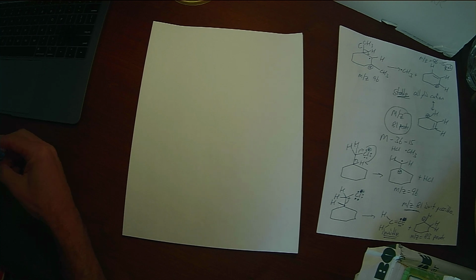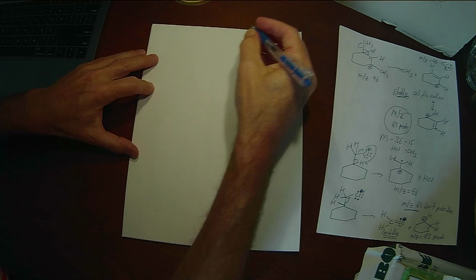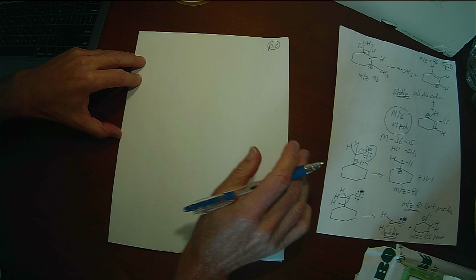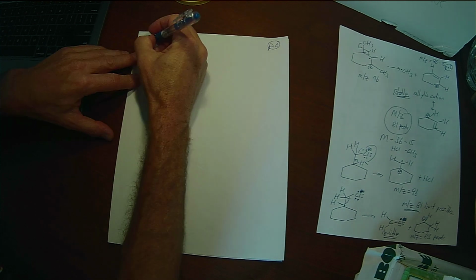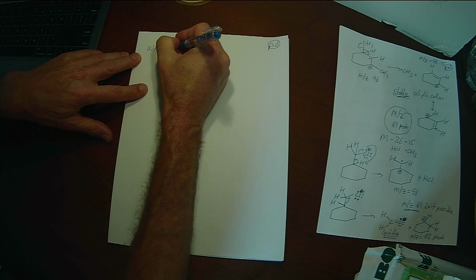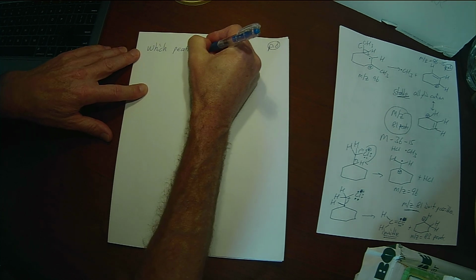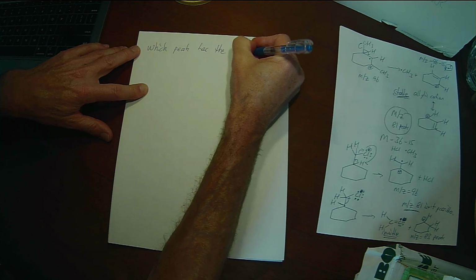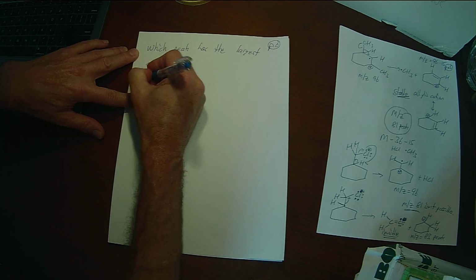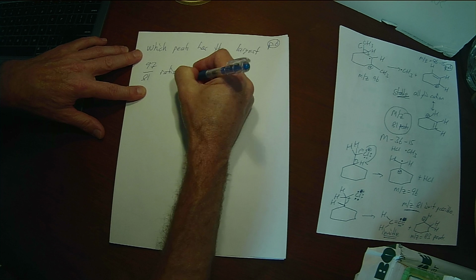Peaks 1 and 2 both have a fairly prominent 97 peak. Which one of those has the more prominent, or in which one of those is the 97 to 81 ratio the largest? Do you understand what I'm asking? The first one. Right, so that's peak 1.